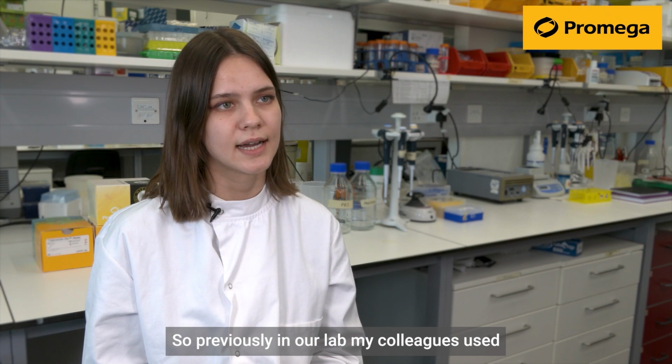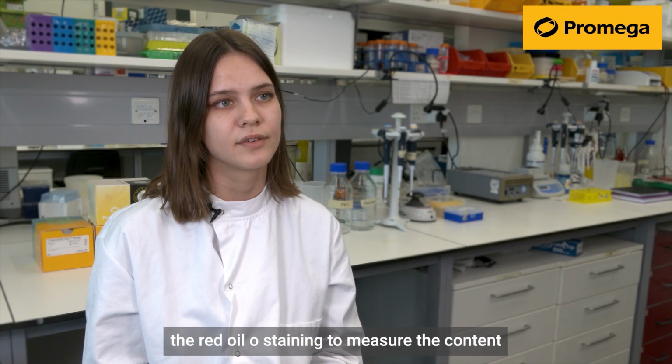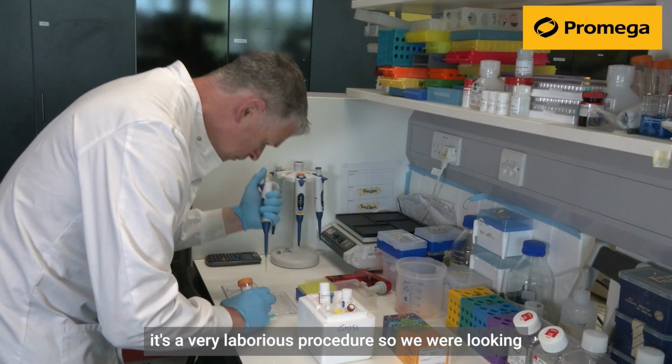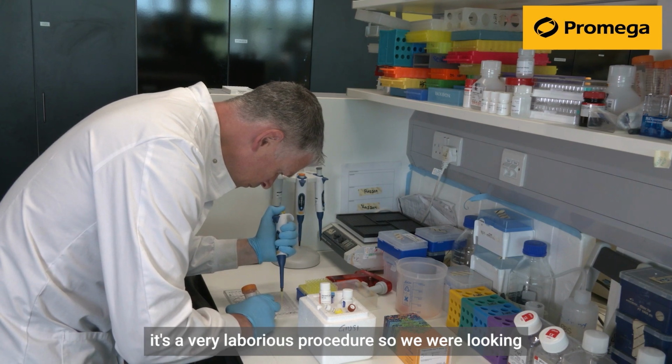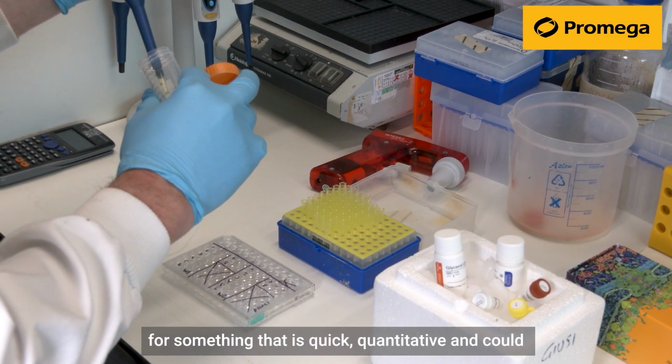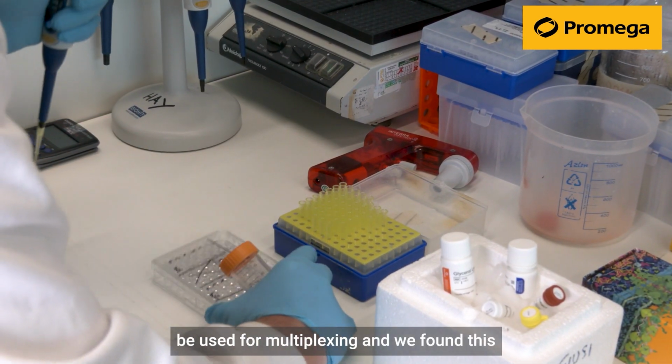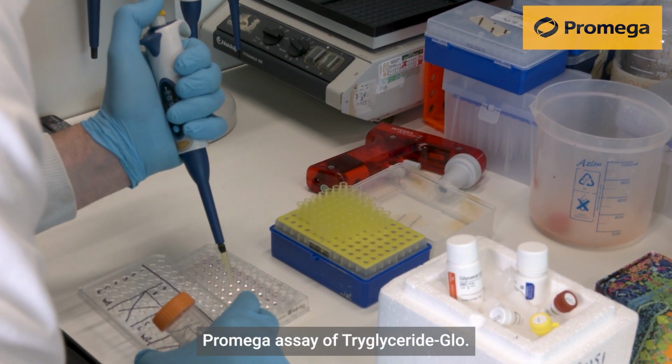So previously in our lab, my colleagues used the Oil Red O staining to measure the content of lipids within the liver spheres. However, it's a very laborious procedure, so we were looking for something that is quick, quantitative, and could be used for multiplexing. And we found this Promega assay of Triglyceride-Glo.